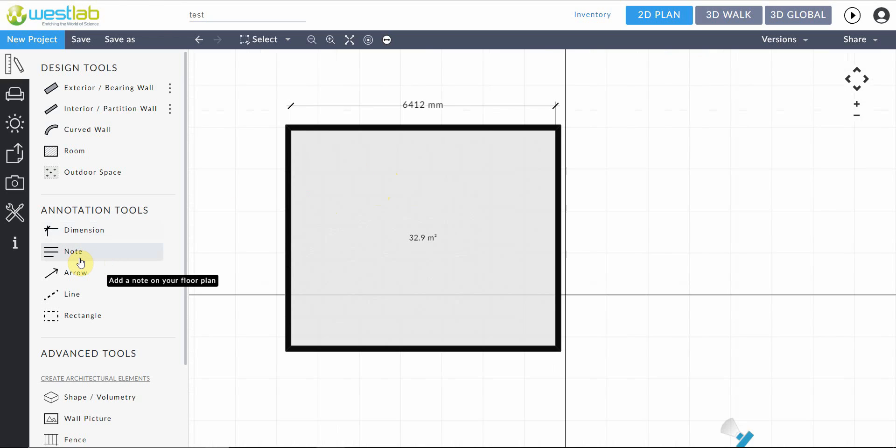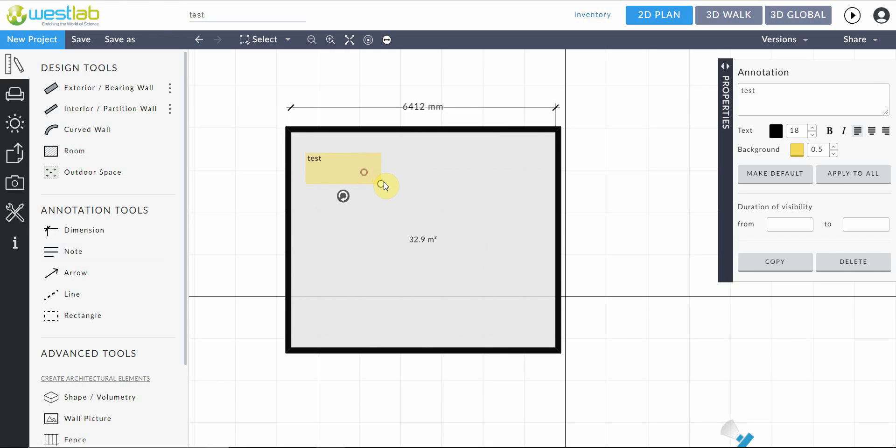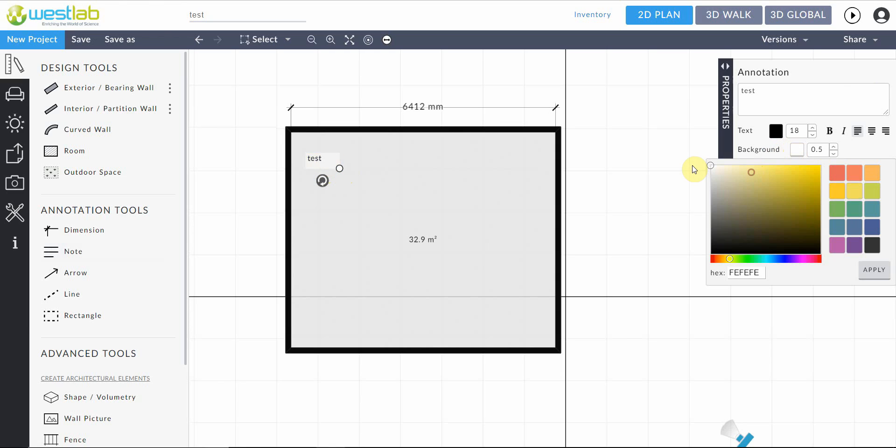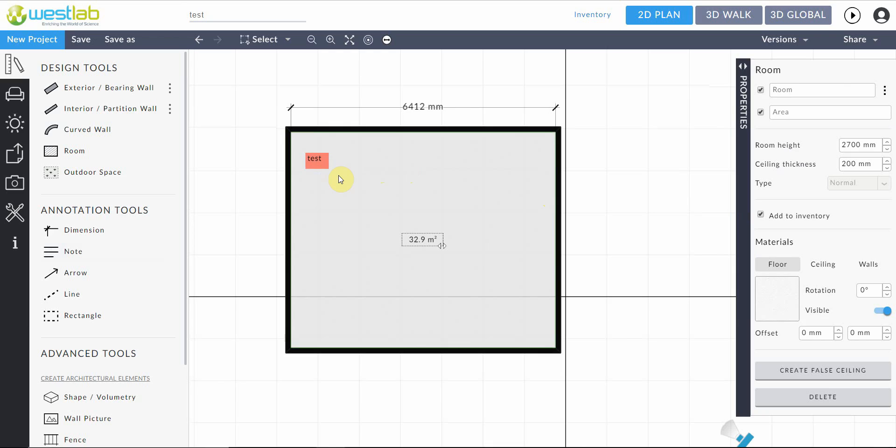We also have the notes tool which we can select and drag out and here you can type in your note. And you can also change the background color to whichever suits. So if it's something important you could change it to red or if you're marking out safety zones. This can also be a handy tool.